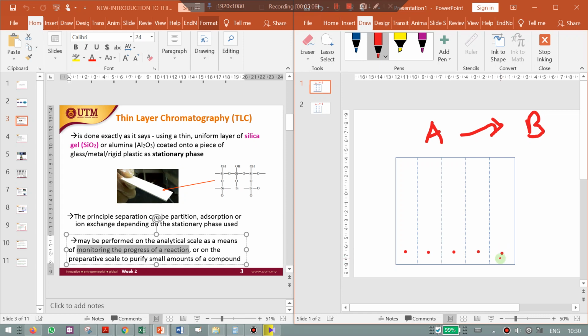You know that after 2 hours the reaction will be complete and you will get your analyte exactly. But you want to optimize the time of reaction, so you want to know the progress. Maybe you assume the reaction is complete in less than 2 hours. So you spot your standard over here, here for 30 minutes, 1 hour, 1 hour and a half, and here for 2 hours.